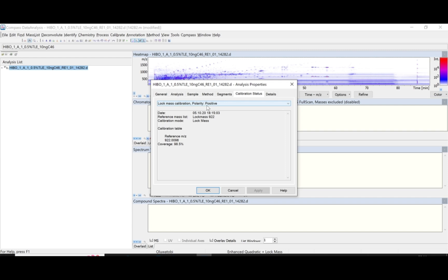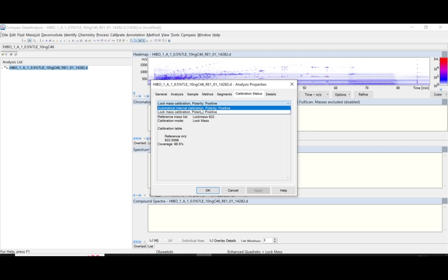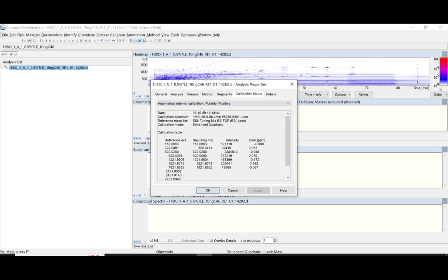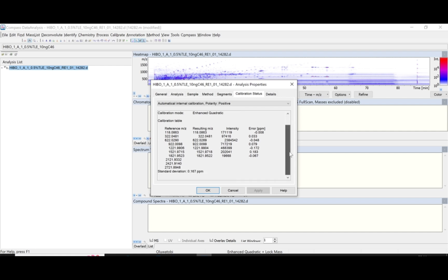For the lock mass calibration, a value that is close to 100% is considered a well-calibrated sample. For the Hintana calibration, a value that is less than 0.5 ppm is considered a well-calibrated sample as well.